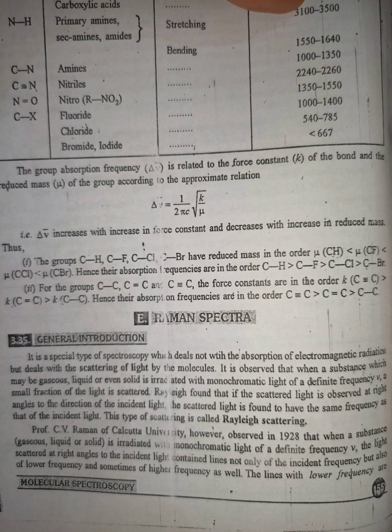Rayleigh found that if the scattered light is observed at right angle to the direction of the incident light, the scattered light is found to have the same frequency as that of incident light. This type of scattering is called Rayleigh scattering.